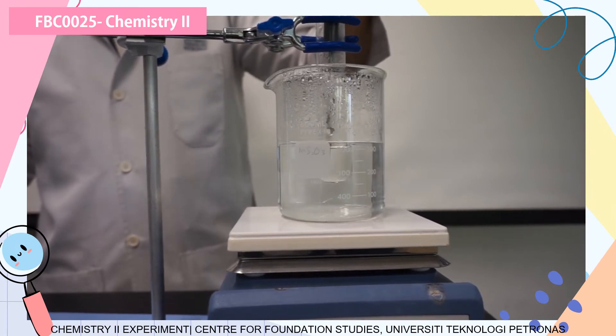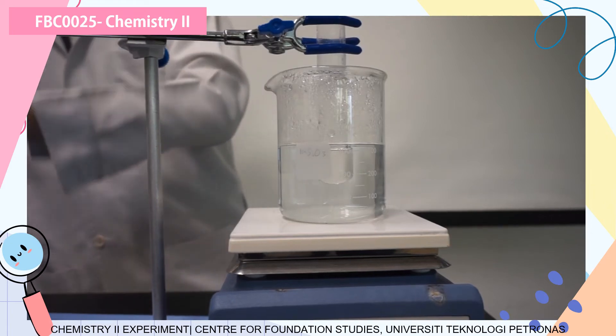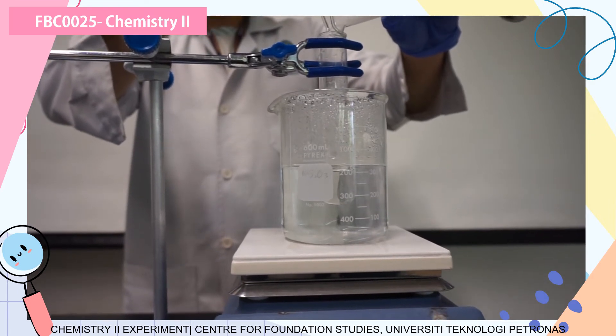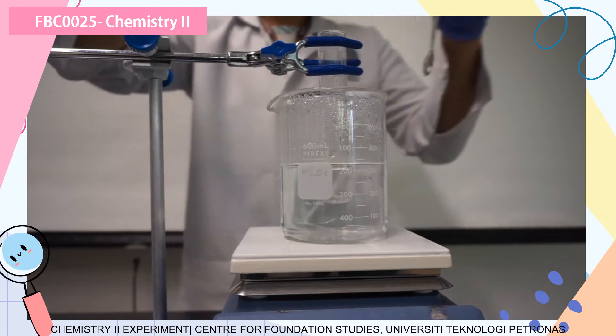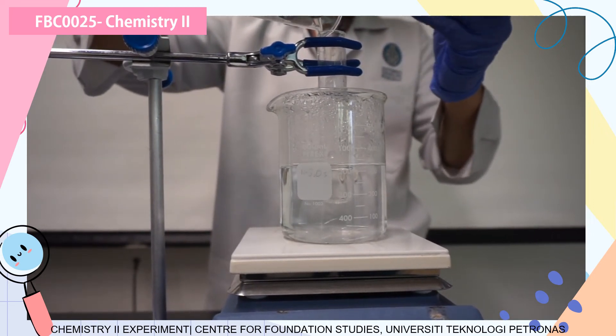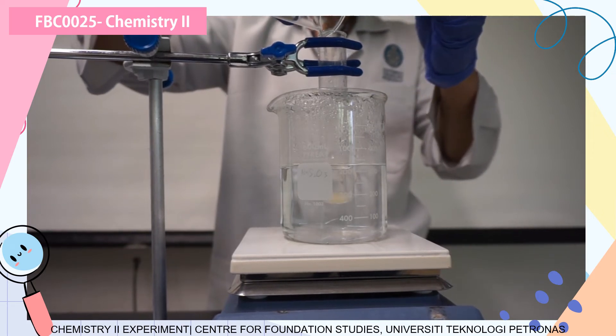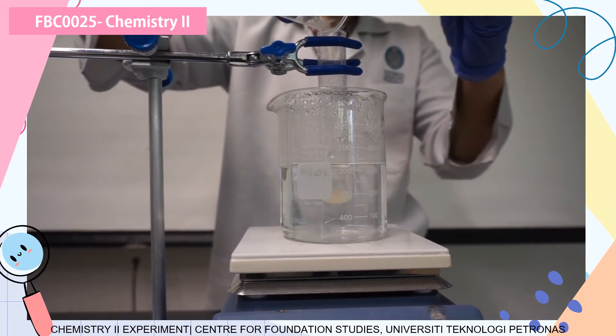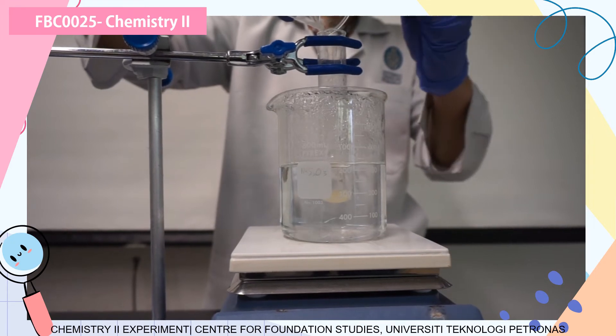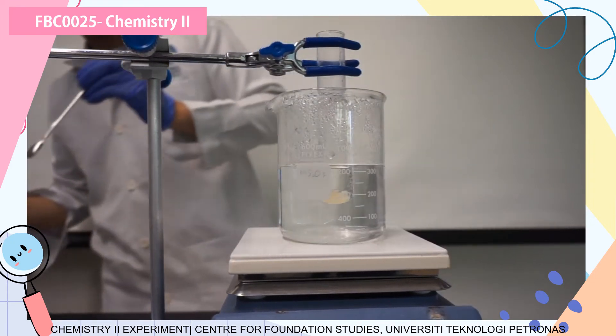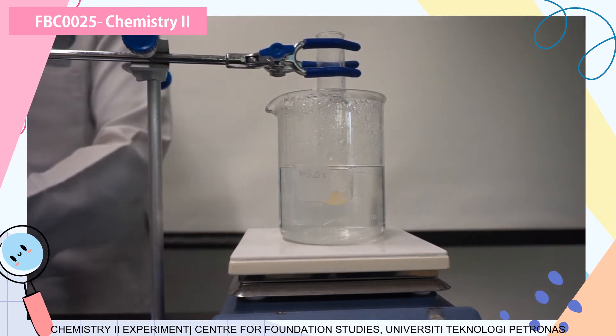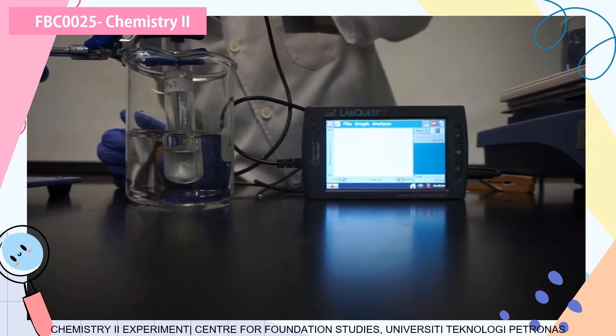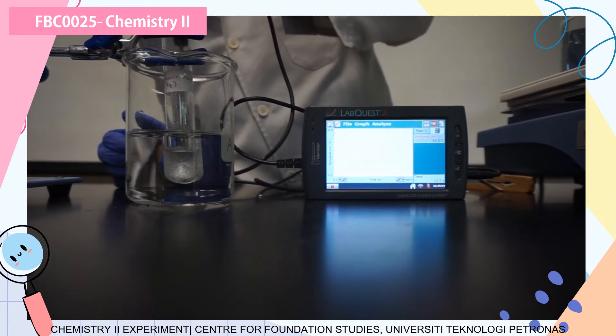Basically, you are going to melt the lauric acid a bit. This is a hot water bath as you can see. We are going to remove the temperature probe first. With the spatula there, I am going to transfer this benzoic acid into the lauric acid in the boiling tube.